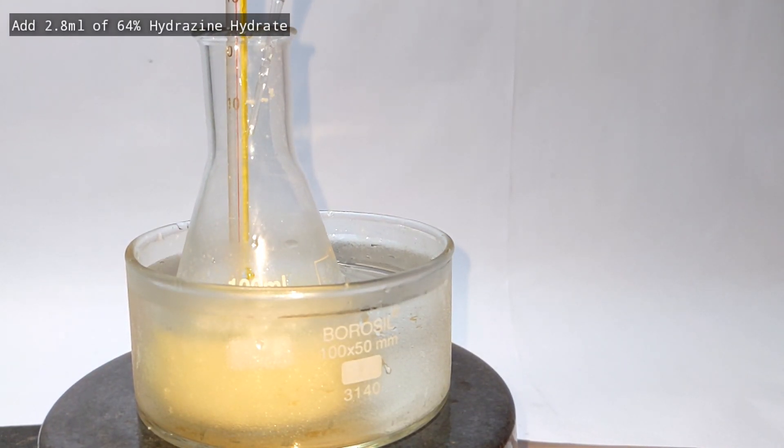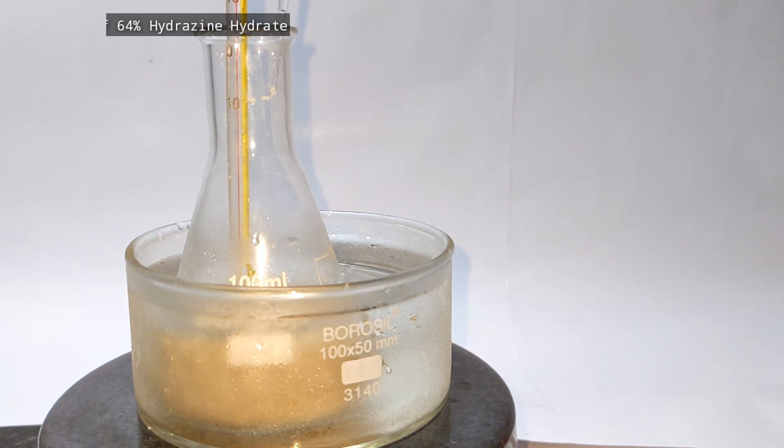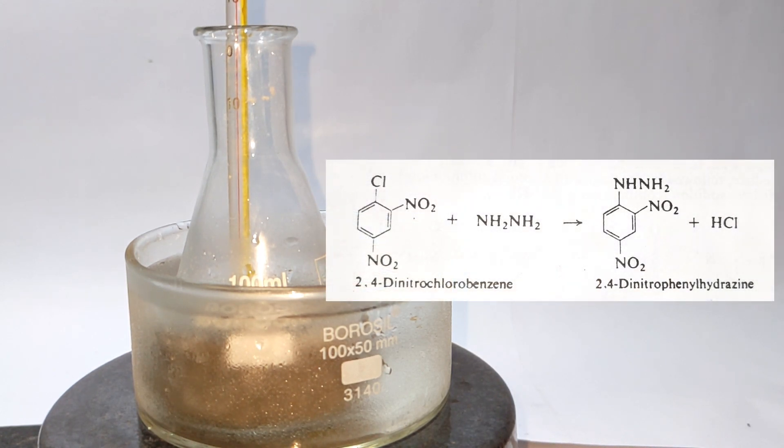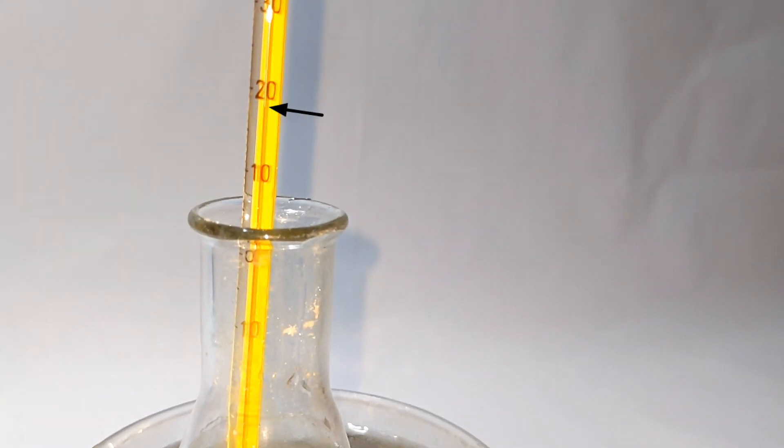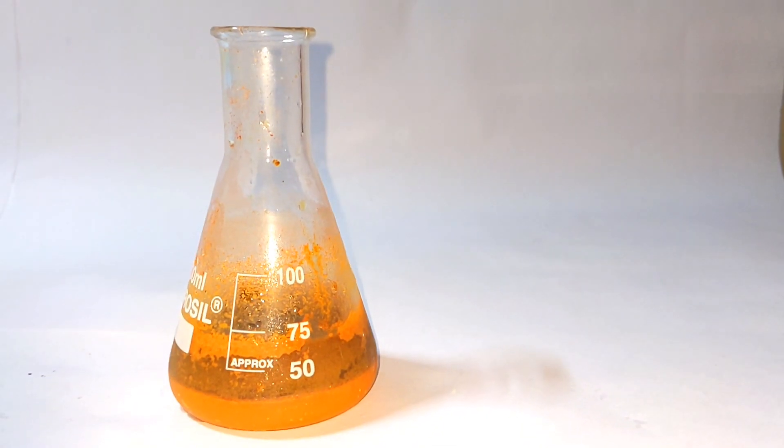Now add 2.8 milliliters of 64% hydrazine hydrate solution. It should be added slowly dropwise with a dropper as the reaction is exothermic. You immediately notice a change in color. What's happening here is the hydrazine hydrate reacts with 2,4-dinitrochlorobenzene to form 2,4-dinitrophenylhydrazine. Always monitor the temperature and make sure it is between 15 and 20 degrees Celsius during the complete addition.